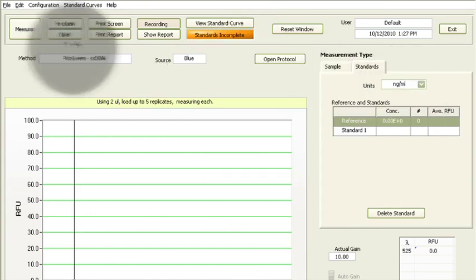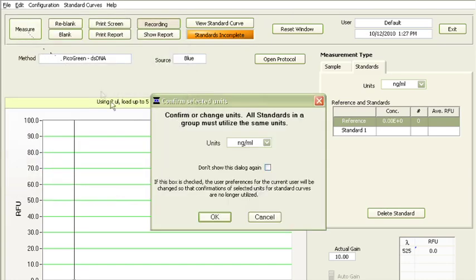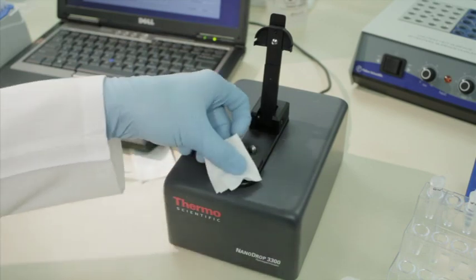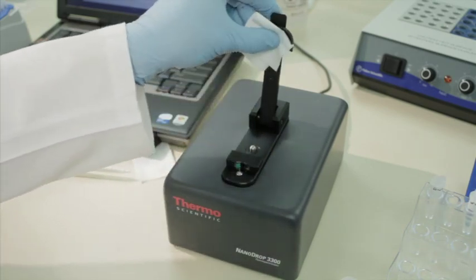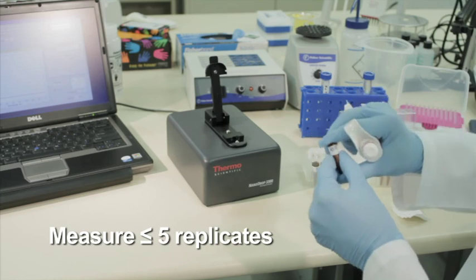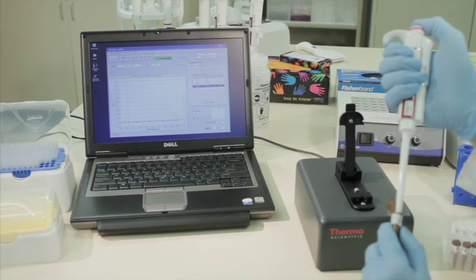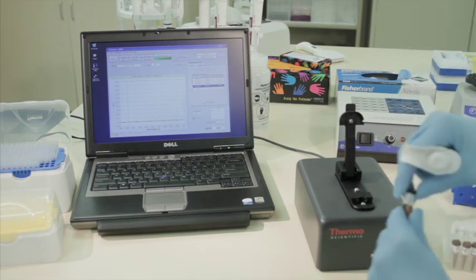Click Measure to initiate the measurement cycle. When the measurement cycle is complete, open the lever arm and thoroughly blot off the sample retention system surfaces. Measure up to 5 replicates of the reference using a fresh aliquot for each replicate. Repeat the process for the additional standards to build a standard curve.